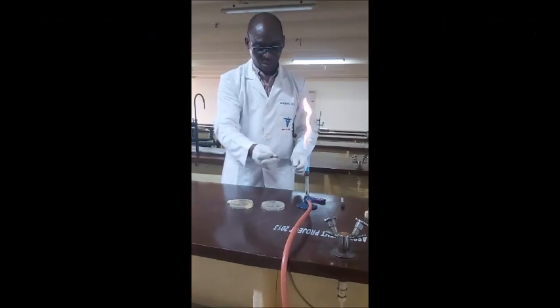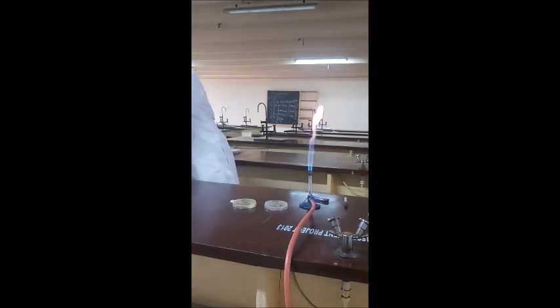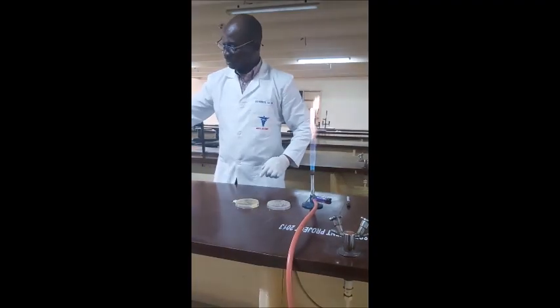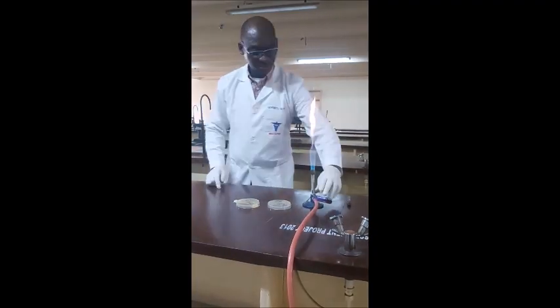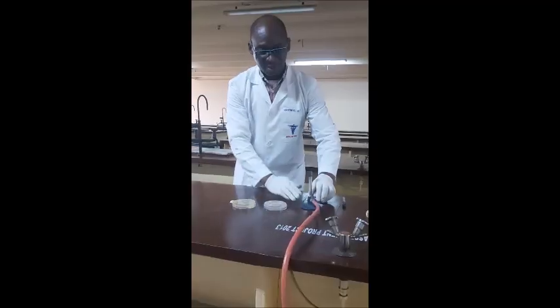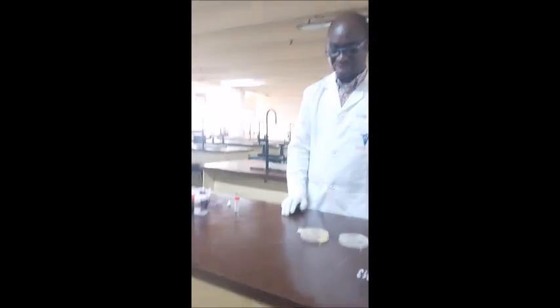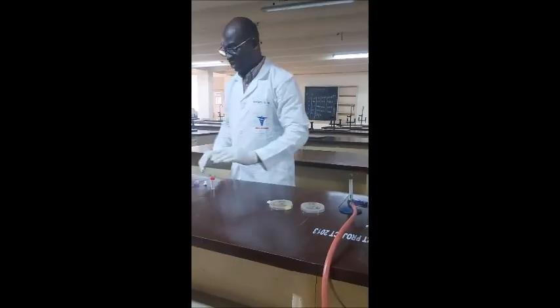It is now physically fixed. You then place it on the staining rack. Make sure you turn off the Bunsen burner — safety is of great importance in the laboratory.